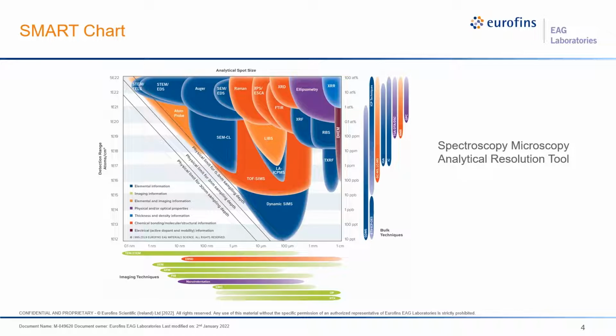The techniques outside this chart are for imaging, where you don't get any compositional information, but get morphological information from the materials. Again, they are plotted with respect to this feature size. They can measure with electron microscopy, transmission electron microscopy having the highest resolution to resolve monolayers or atoms in a material.